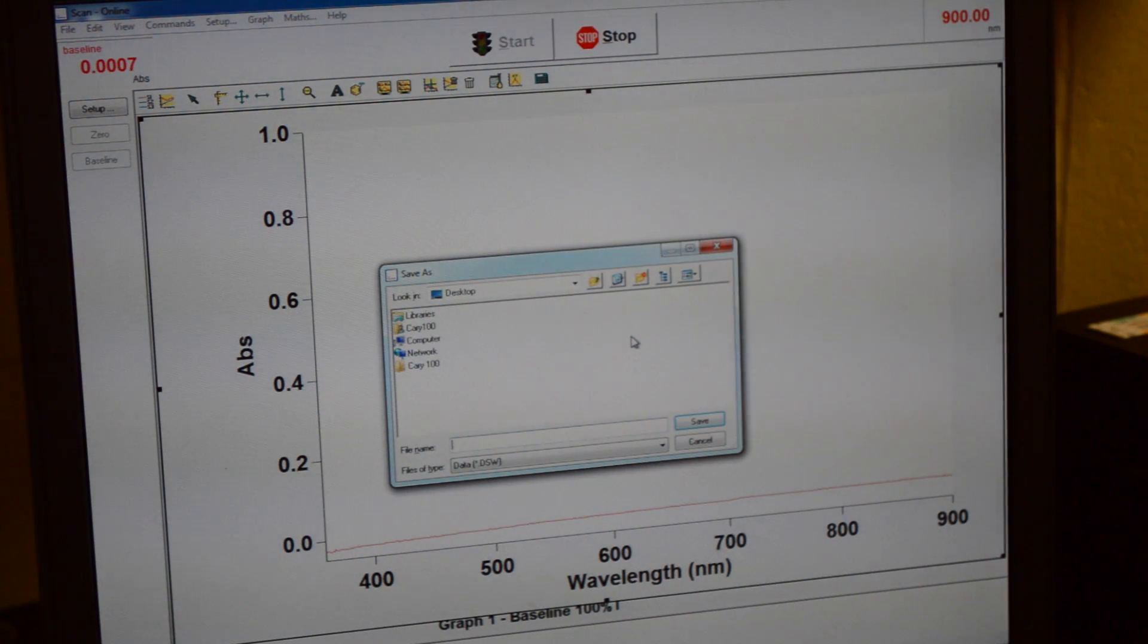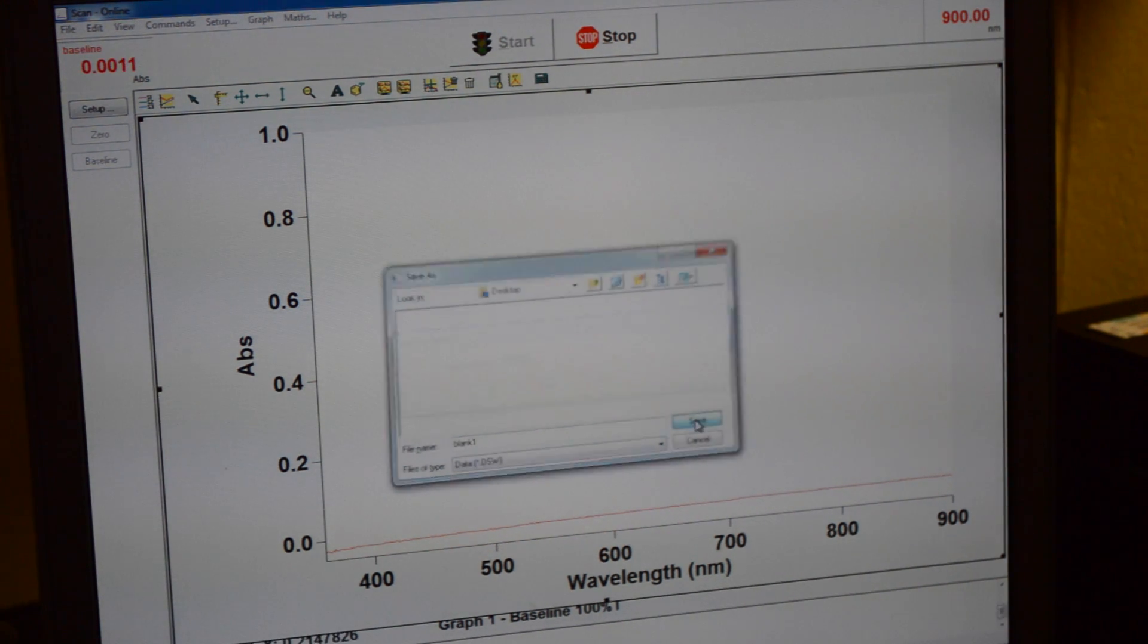You can make a file name related to your compound. So I'm just going to put in blank one and then it will come up as sample name one. You press OK.